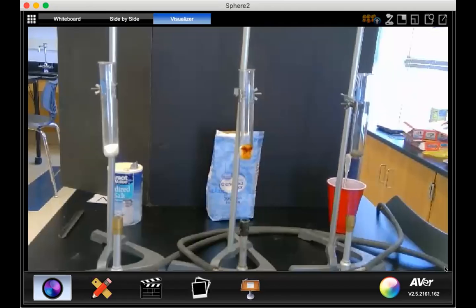It's going to be a little tough to see for some of you what's occurring, but not much happening in the salt container. The sugar obviously has got some action going on, doesn't it? As you see it kind of turning yellow and brown, and we're starting then to see the bubbles forming.